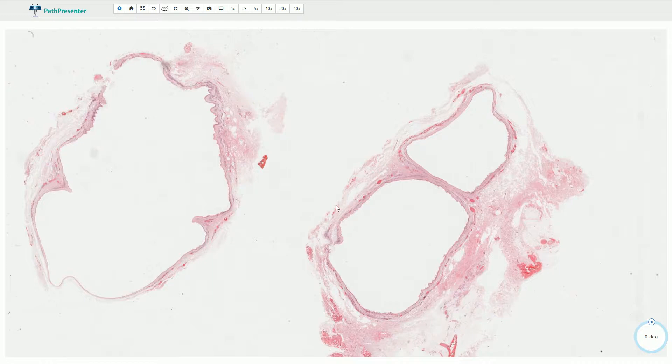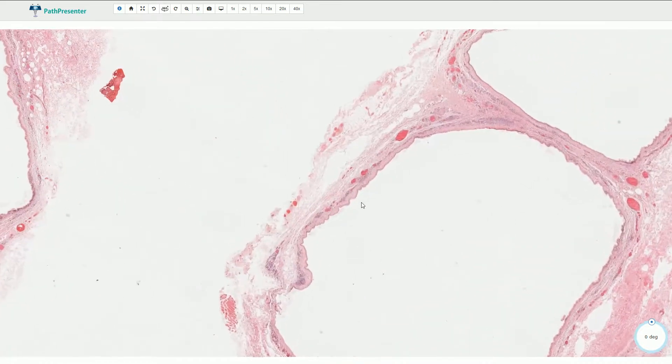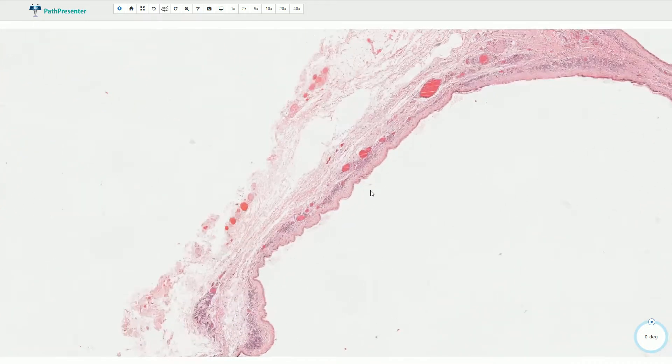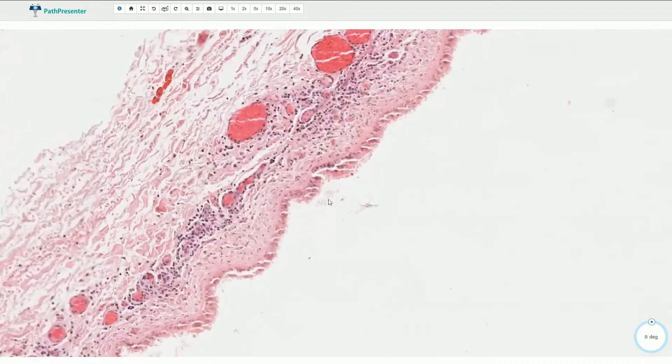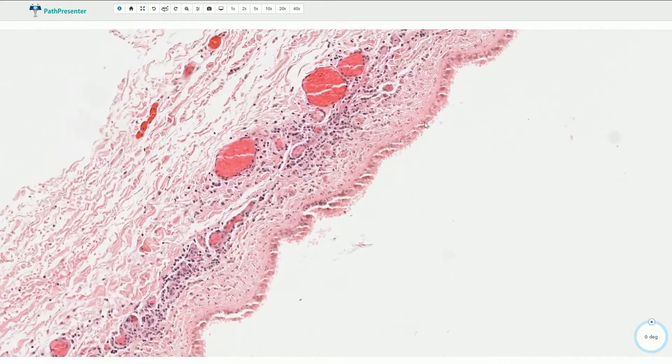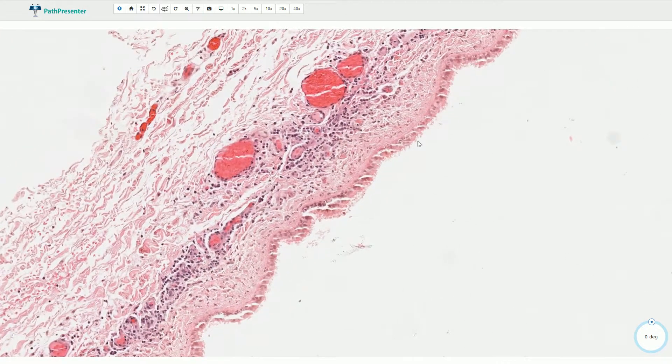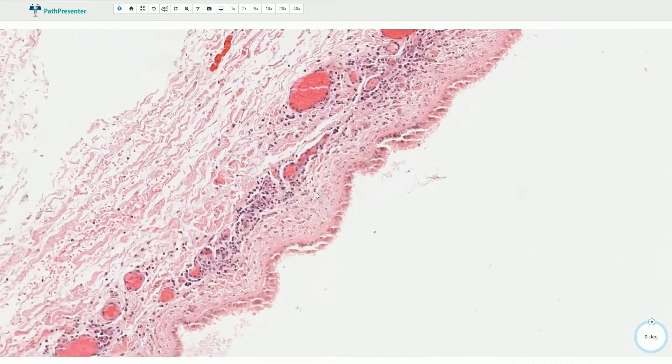And microscopically we have here the cyst which is lined by respiratory type of epithelium. This is the pseudostratified cylindric ciliated epithelium lying on the basement membrane.